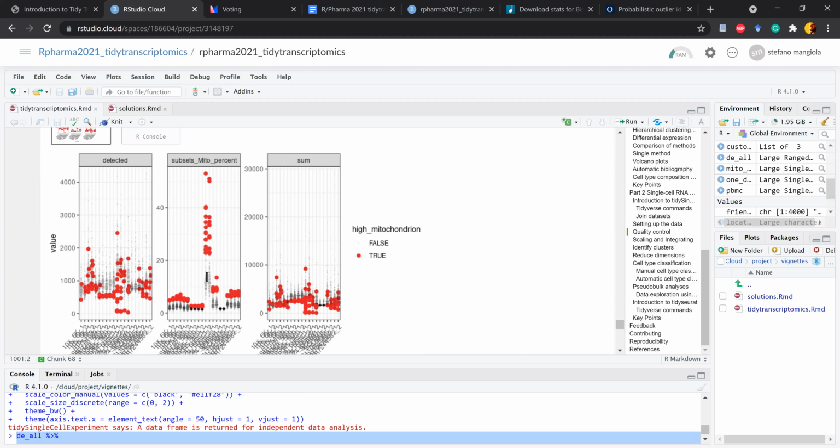Okay, this is just an example, but it's as easy to use ad hoc visualization as it is to build a custom ggplot in this case. And we can see that some cells for each sample have very high mitochondrial transcription, and these are likely dying cells. These cells also have a low transcript abundance overall. So this is also an indication of dying cells.